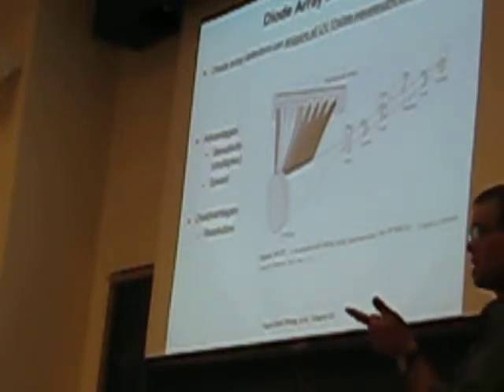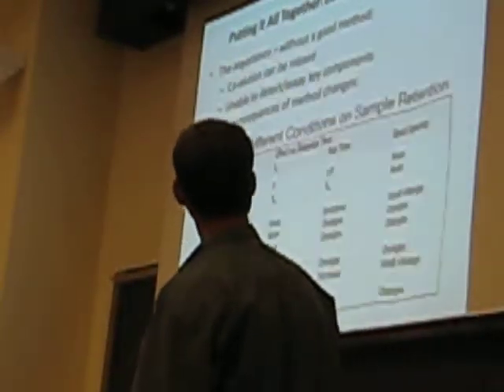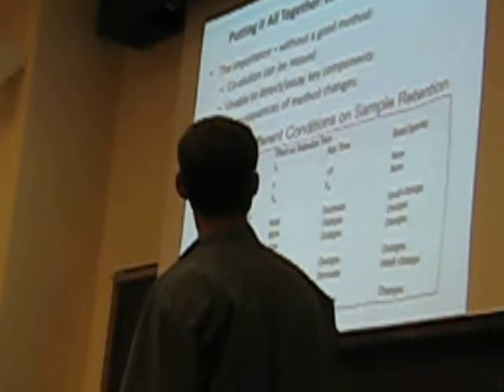And you'll see when we go on and talk about atomic absorption and atomic emission that most of the instruments now are fitted with a CCD detector, just like exists in a camera, except much higher quality. Those CCD detectors can detect many different wavelengths of light simultaneously. That's a huge advantage.